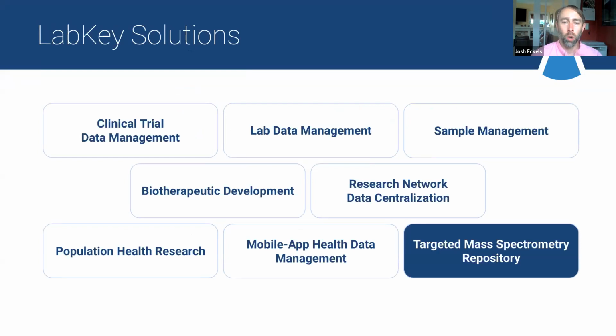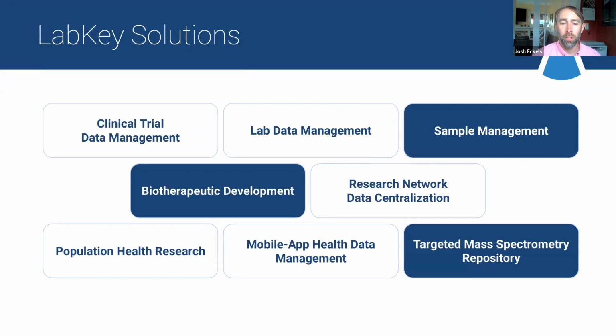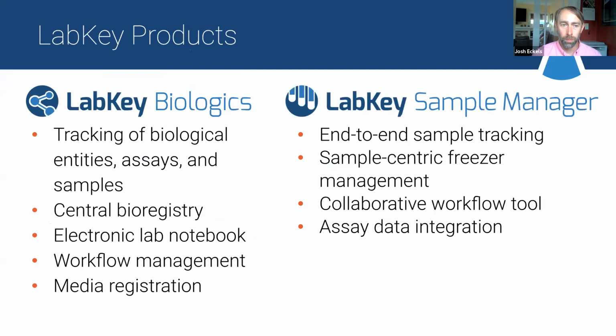But we've also been working on some other very related things around biotherapeutic development and sample management that I wanted to highlight very briefly here, because we see the potential for a lot of great connections with Panorama going forward.